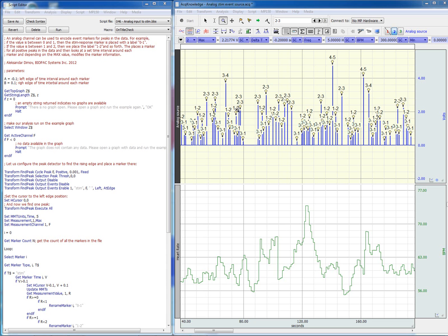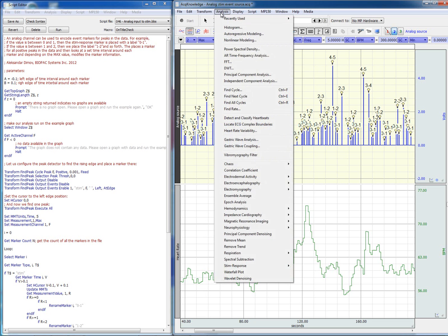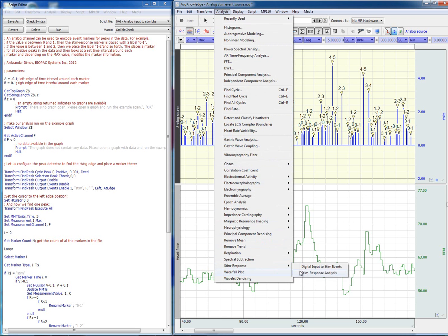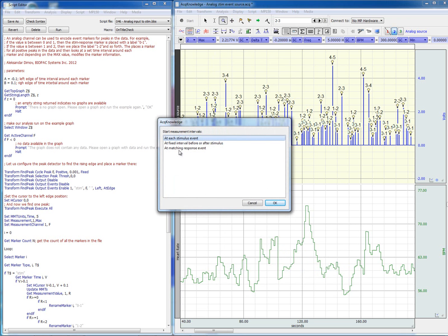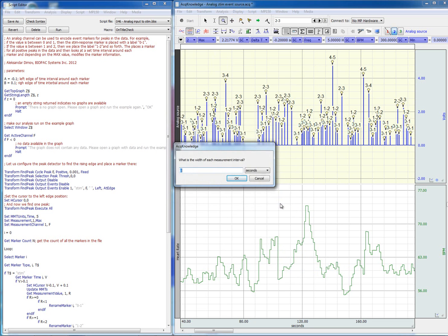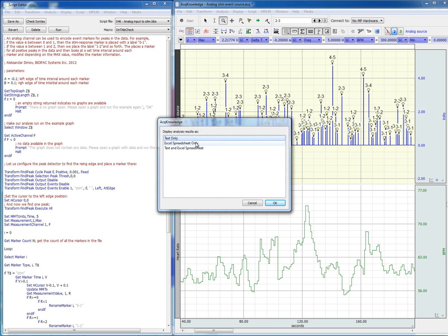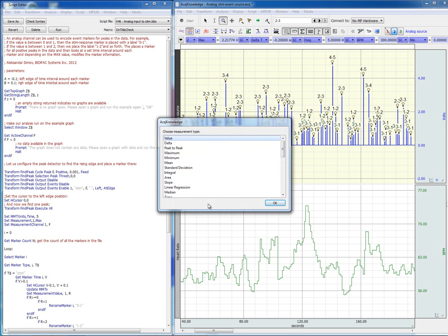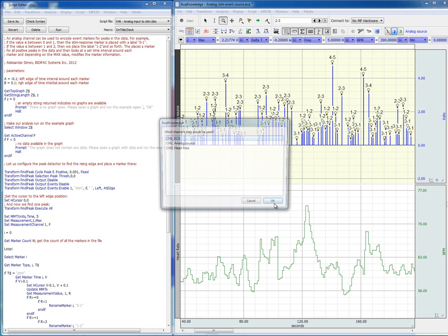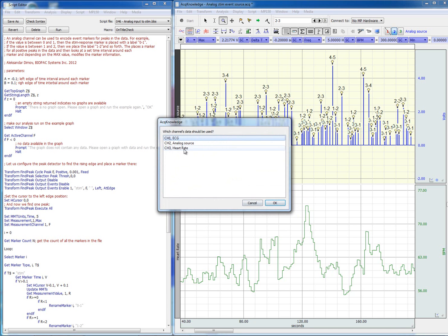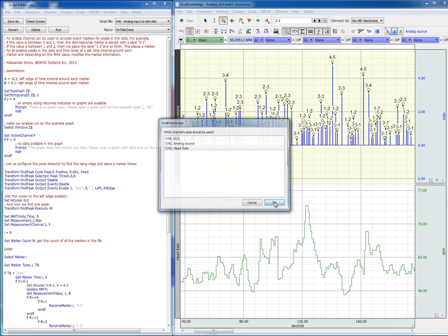We just have to go to stem response analysis and let's perform a measurement at each stimulus event, and it will be only for 200 milliseconds. We output the result into Excel, and we'll just use the mean measurement on the heart rate channel.